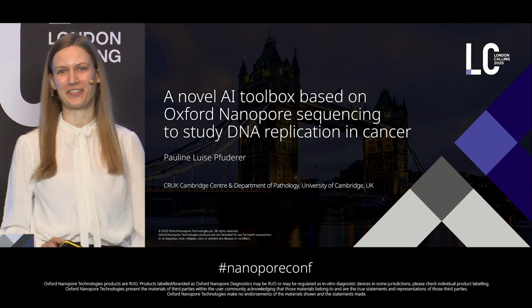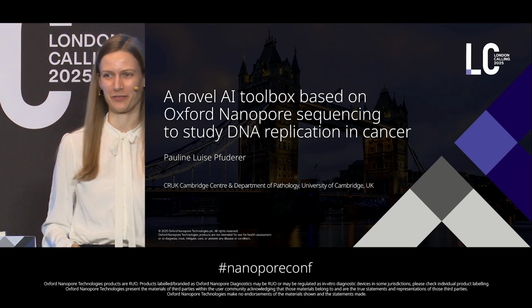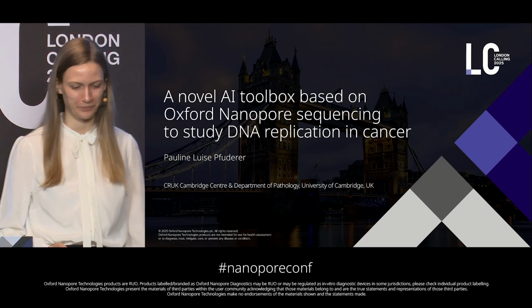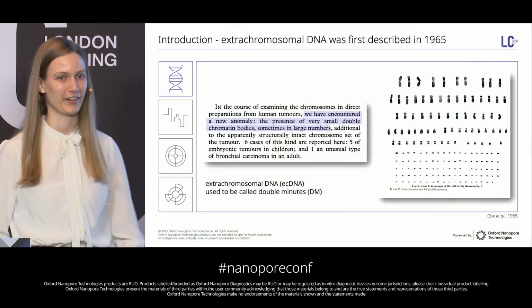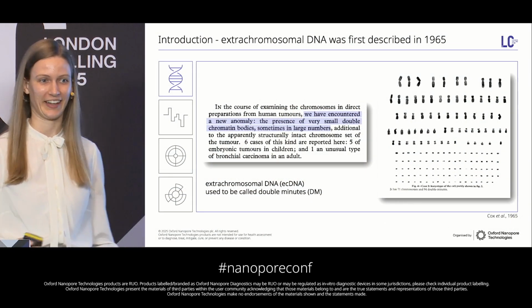It's a real pleasure to have the opportunity to talk about one of my PhD projects here. I'll start with a bit of an introduction of why we should care about extrachromosomal DNA in cancer.